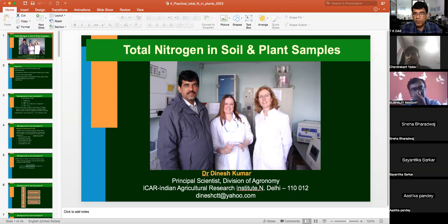So we need to know dry matter also, dry matter yield simultaneously, depending upon the stage of the crop. Suppose you have cereal plants like maize, wheat, rice, etc. If they are in early stage, that is vegetative stage, when there is no reproductive stage, at that time you can harvest the whole plant material and know the dry matter of this plant material and multiply it by concentration of nitrogen, you can get the uptake.